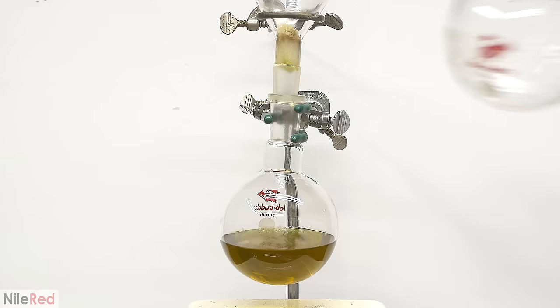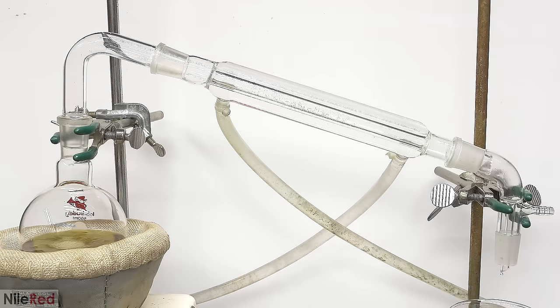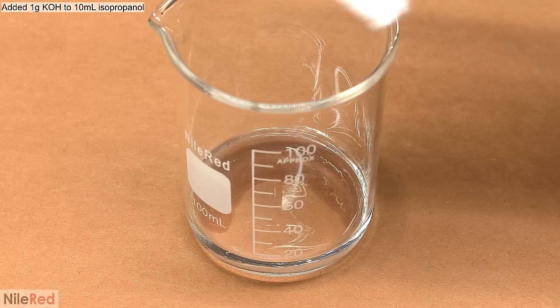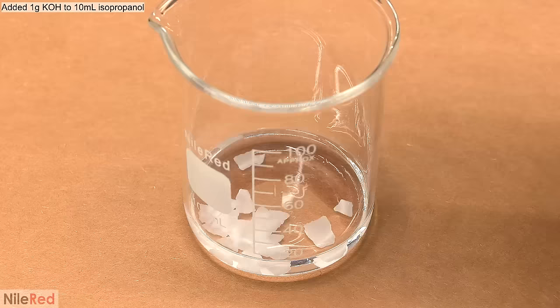I packed a cotton ball into a funnel and I filtered it through. Once everything had passed through, I washed the round bottom and the funnel with a little bit of warm isopropanol. I took away the funnel and I added a magnetic stir bar to the flask. I now need to get rid of most of the isopropanol and to do this, I use a simple distillation. In the meantime, I prepare a base solution.